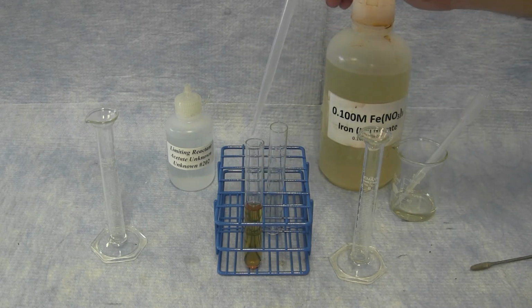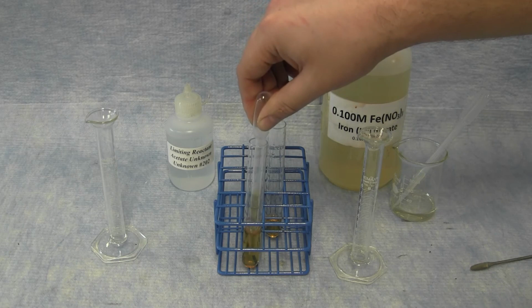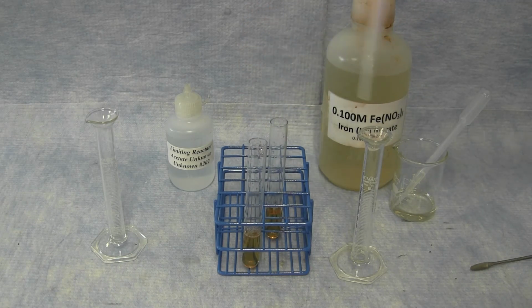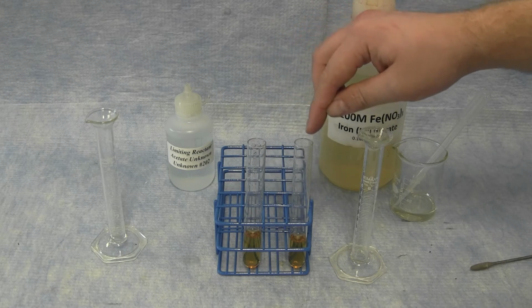You'll then take half of this solution and place that into a separate test tube. Now you have the same iron acetate solution in each test tube.